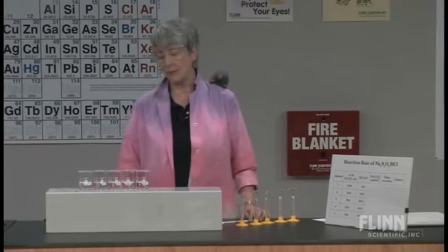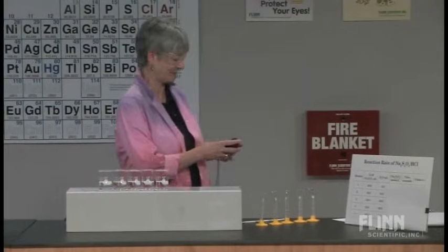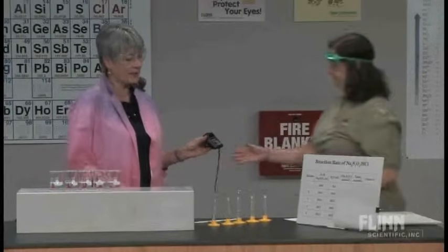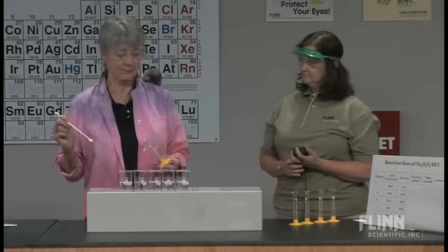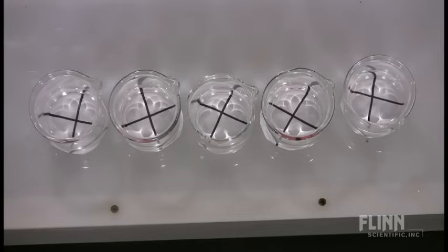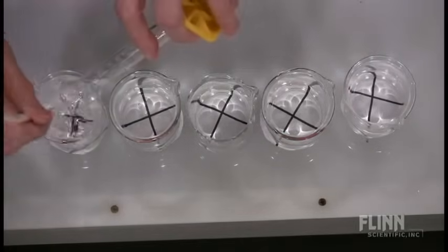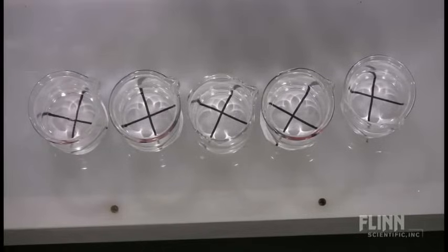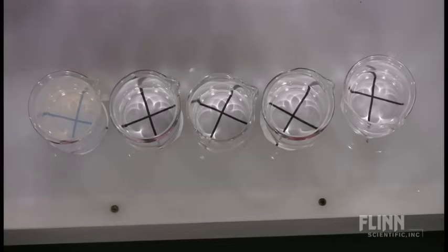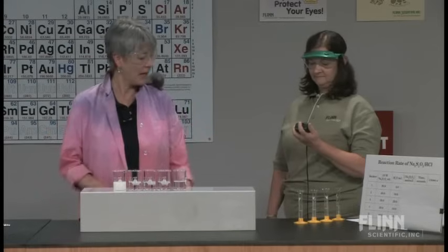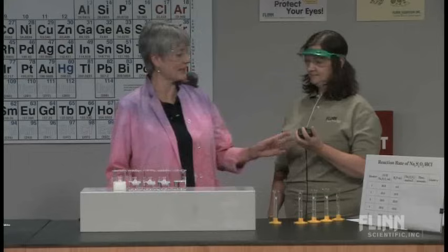Students are going to observe the disappearance of an X as that colloidal sulfur forms, so we need to time this. Can I get a volunteer? Janet, I'm going to tell you when to start and when to stop. I'm going to put the hydrochloric acid in here and then tell you to start and stop. Start. Now I'm going to tell you when that X disappears. If you look from the side, you should start to see the cloudiness. Stop. How many seconds did that take? 18.68 seconds.